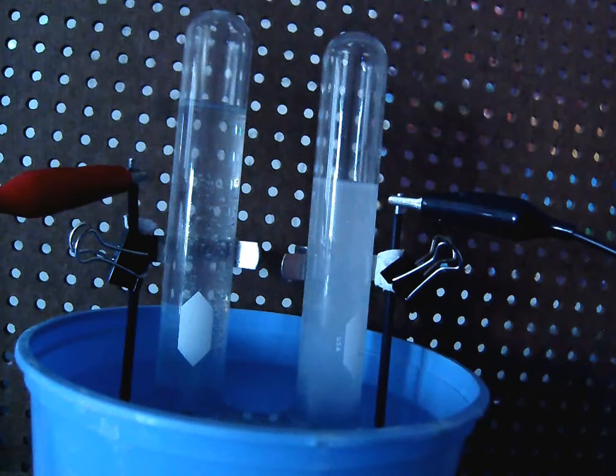Flammability is a characteristic property. It can help us to distinguish between things. So at this point in the lab, because we can't really tell conclusively which one is hydrogen and which one's oxygen, although we can tell based on using our logic, if we wanted to find out conclusively, we could see how they react, how their flammabilities differ from each other. And then we could say certainly one of them is hydrogen and certainly one of them is oxygen.